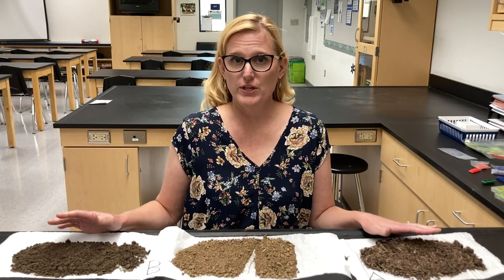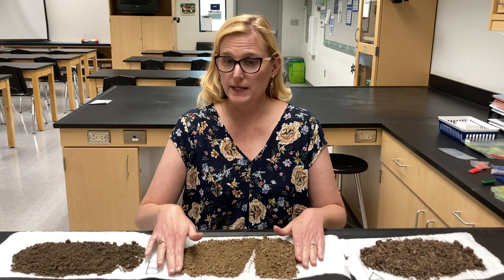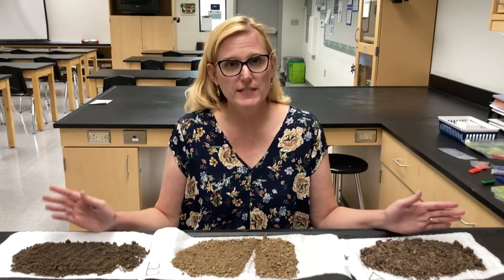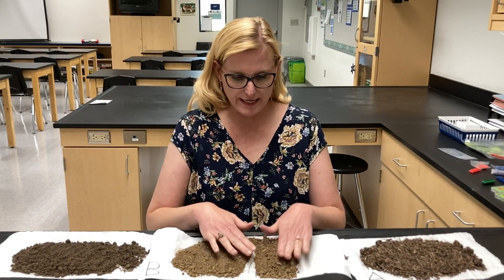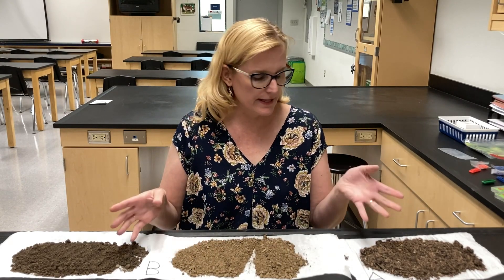Now we're going to test our three soil samples. I have sample A right here, B and C. These samples have been left out to dry, and I took out rocks, twigs, and things like that.